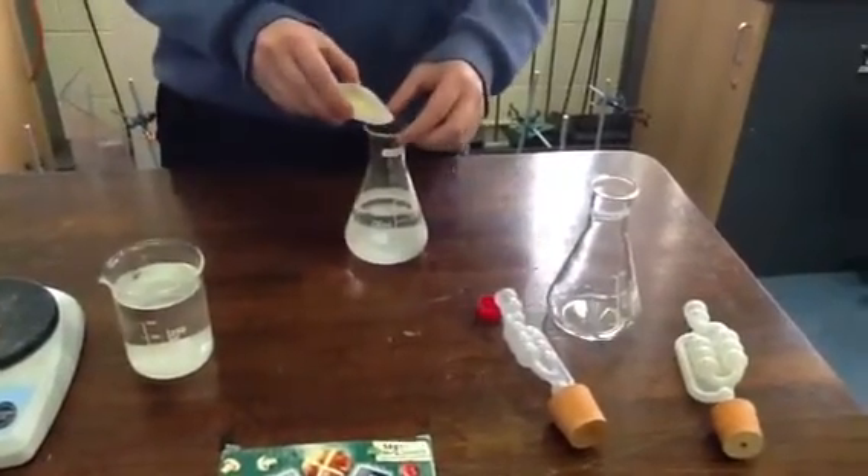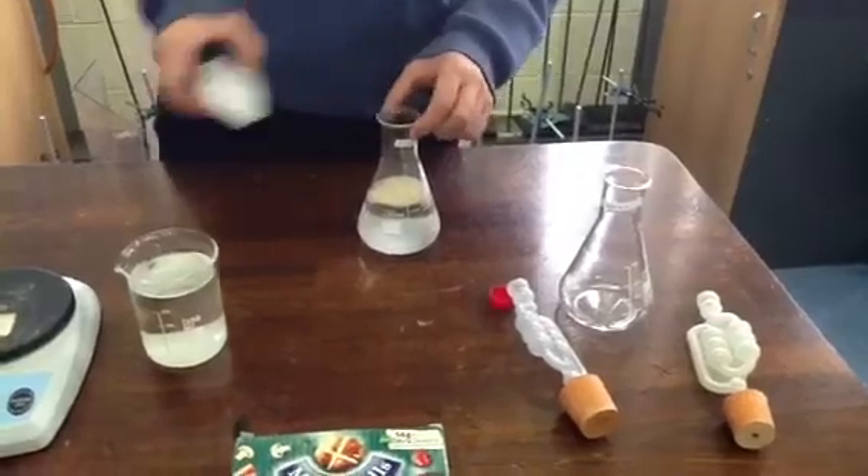And how many grams of yeast are we going to add, Chloe? Five grams of yeast.